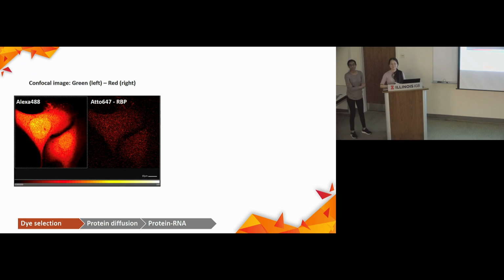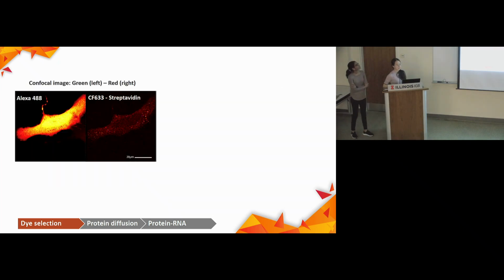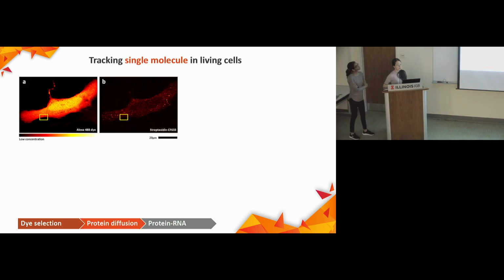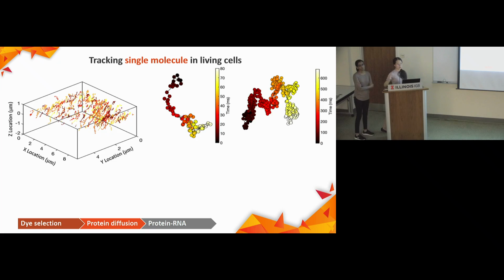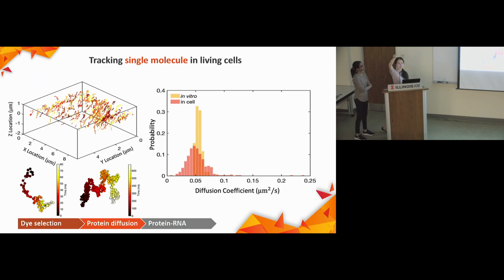Yep. How do you characterize subdiffusion and superdiffusion? Oh yeah, this is very preliminary data. We will collect more new data once we get the 3D mirror again. But the subdiffusion and superdiffusion, you can tell from the trace. One is going to be curved, one is going to go higher, right? From the trace, you're able to tell whether it's leveling off, whether it's always linear, or it curves off, or it goes higher.